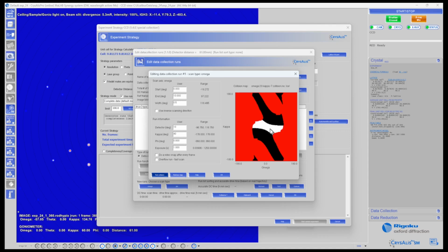It can freeze the sample holder, and this again can lead to decentering of the sample. So we should generally avoid doing scans in the icing zone. If we move through the icing zone rather quickly, there's no problem, or if you do a short scan in the icing zone, there's no problem as well, but you should be aware of it and try to avoid long scans in the icing zone.